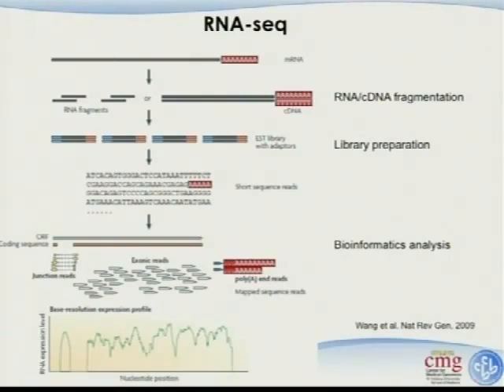There's a bunch of consecutive A's towards the end of the reads. Once you find it, you remove it but make a mark, and then align the rest of the reads. That helps you define the end of the gene, which is a really nice feature. We don't do that in our lab regularly yet. Hopefully we'll do that in the future.